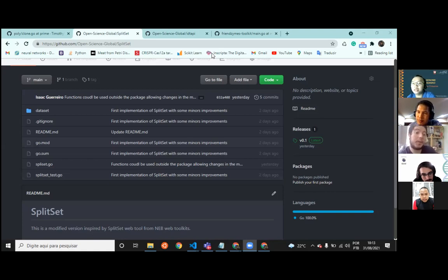It's a free algorithm. So there are publicly available de novo assemblers that can generate a whole genome sequence from your contigs, and I think that's fairly easy. That's fairly straightforward because these softwares are available publicly. I'm not sure of the copyright.